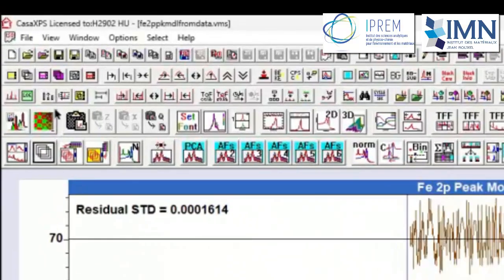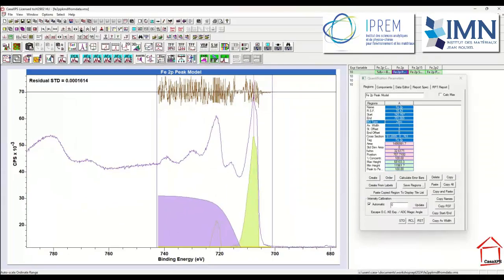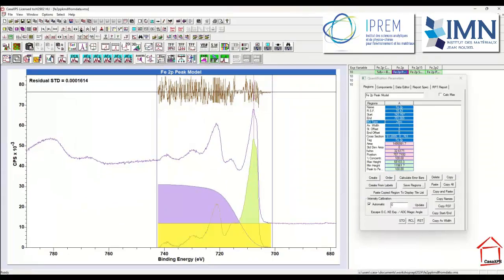That was ticked by using this option here, and then I can rescale. And once I rescale the zoom, then because this is active, and you can see a black line at the bottom, that indicates that it will rescale to 0. This is typically used when you're using TOF Sims data. For XPS data, as I say, the default is to go to the minimum of the intensities. So the Sims option is useful when working with data such as these that have a peak model that involve a range of intensities that are added from 0. So that's one of the options.